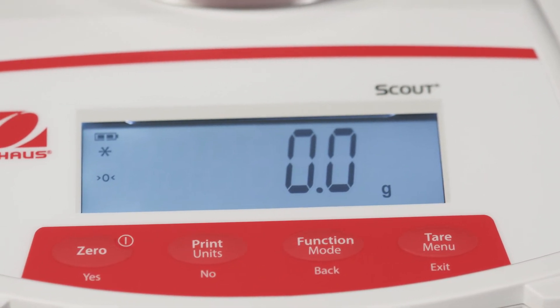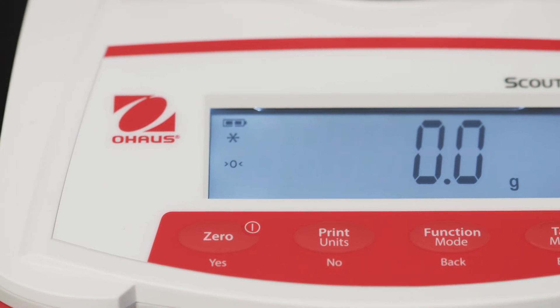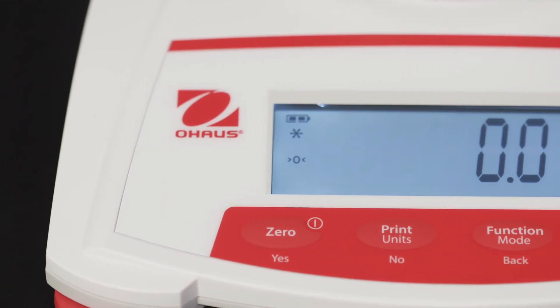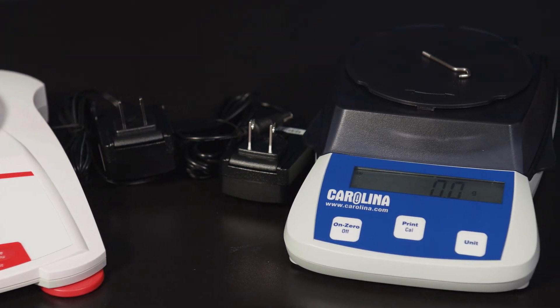The Ohaus model can measure in grams, newtons, and ounces, features a backlit display, and comes with a five-year warranty. Some models have additional units of measurement.